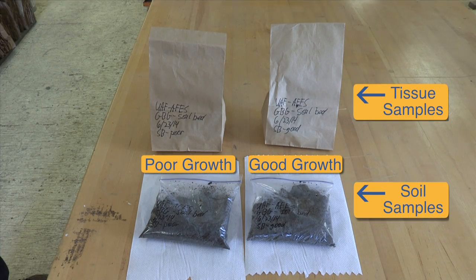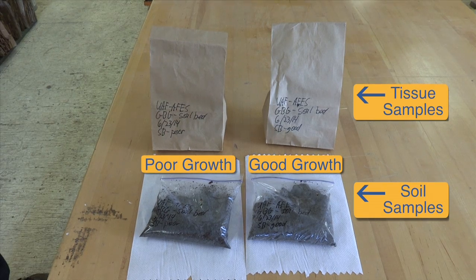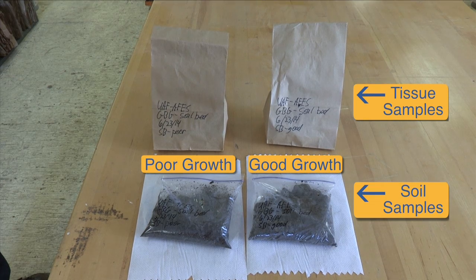Combine all the soil samples in the same zipper-type plastic bag. You should have 2 plastic bags, one with the good growth soil and one for the poor growth soil. Here again, moist samples in a sealed plastic bag will continue the biological processes. This will change the nutrient status of the soil dramatically. So, the soil samples need to be dried as soon as possible. Leave the bags open to aerate until you're ready to send them to the lab. Mail them off for continued drying and preparation as soon as possible after the collection.